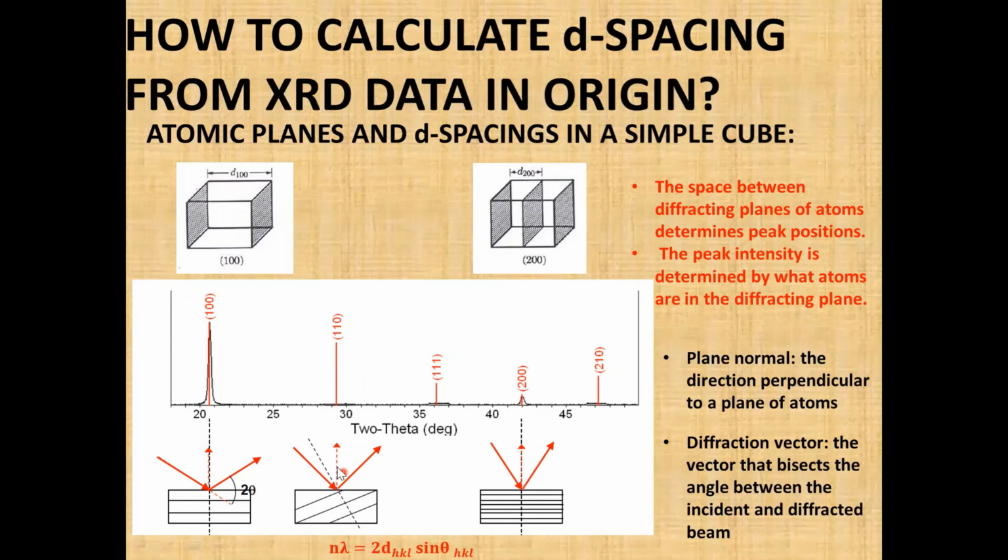If they are properly aligned like this one, then of course a diffraction peak would be produced. Because they are not properly aligned, we observe only the background.